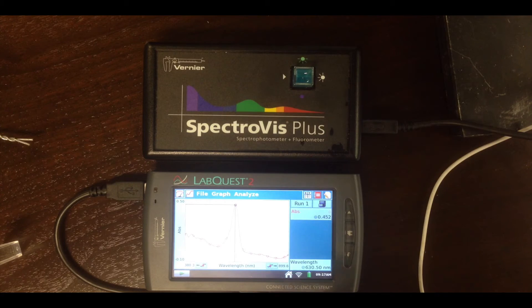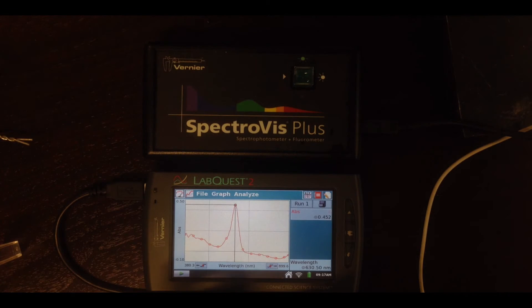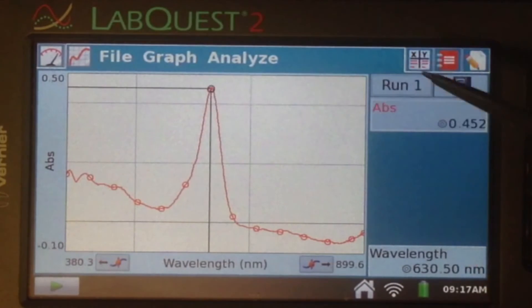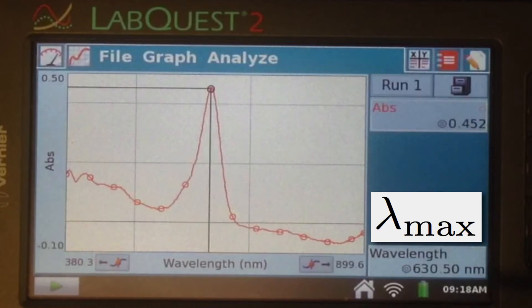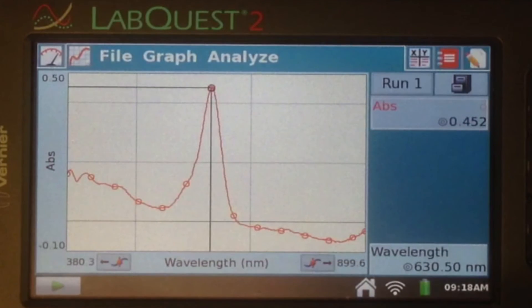When you stop, the spectrum gets recorded and the LabQuest automatically picks out the point where absorbance is at a maximum. You can see here the absorbance is at a maximum, showing you both the absorbance value — in this case 0.452 — and the wavelength where that occurred: 630.5 nanometers. It's important to record both. This wavelength is referred to as lambda max — the Greek letter lambda stands for wavelength, max for maximum absorbance. It's a very important wavelength for absorbance spectroscopy, and knowing the absorbance value is also important, so it's worth noting that as well.